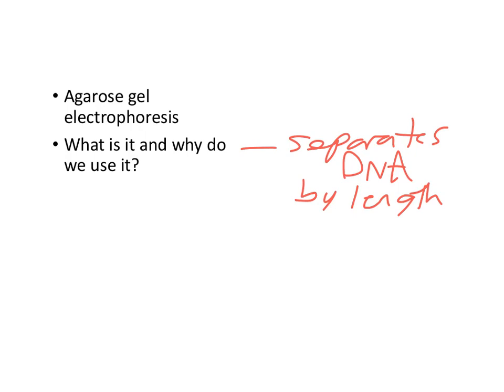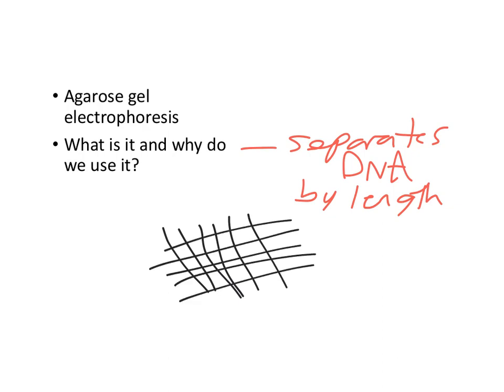Agarose gel electrophoresis is basically Jello or agar. It's a matrix. When it's hot, it's liquidy. You melt it in a microwave or you melt it in an autoclave, pressurized microwave. Well, not really. And when it cools, the molecules of agarose or agar form a matrix. They solidify, they form a regular structure, kind of like Jello, it's kind of wobbly.